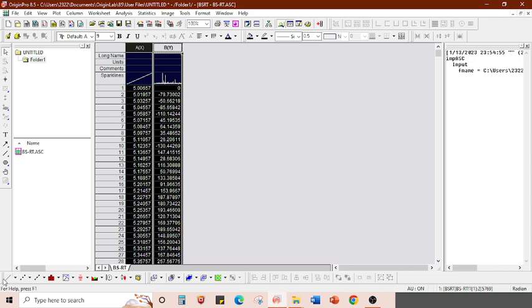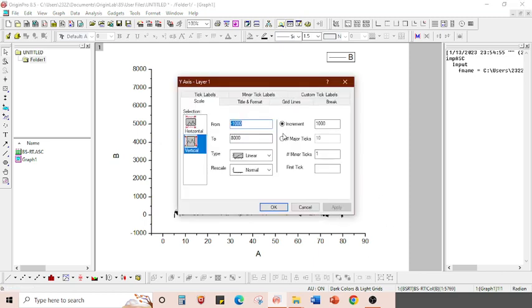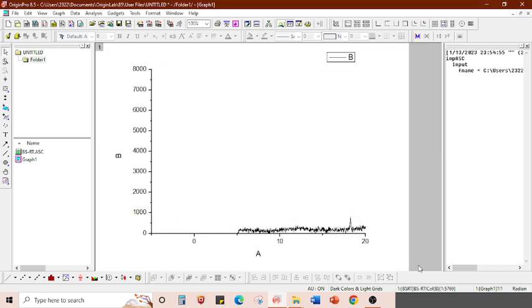Then you go to the rightmost corner, select Line graph, and you get a graph. In some cases the whole graph will not be visible. For example, if you have done some previous scale where your scale was not perfect, your graph may look like this, but this is not your whole graph.